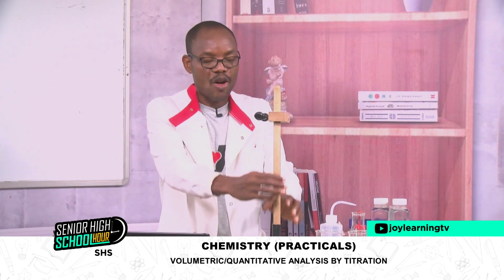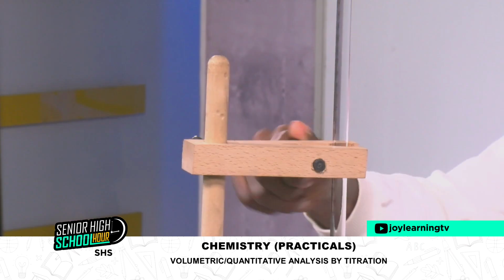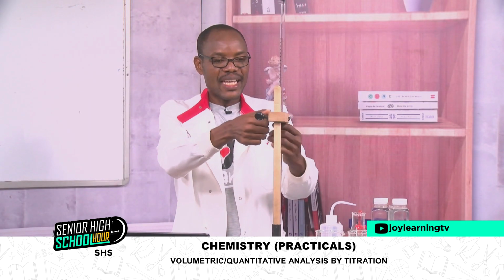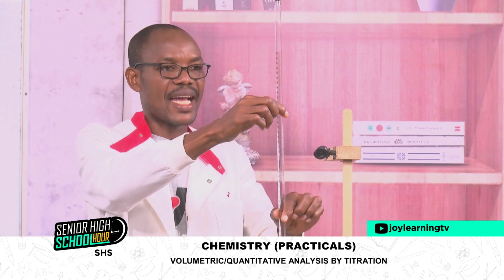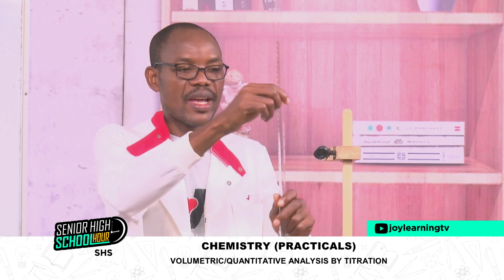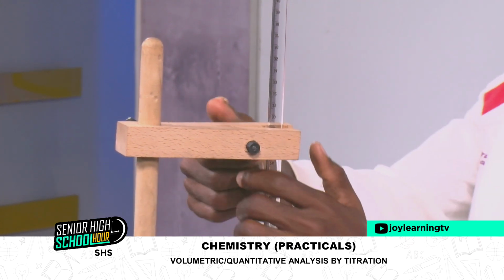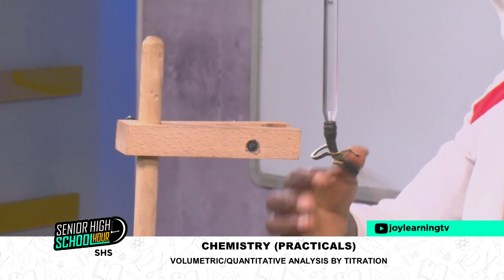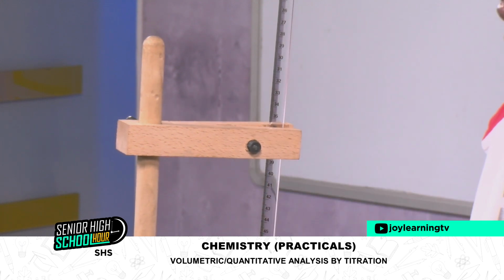Because it is the burette stand or the retort stand, I can mount my burette on it like this. When the burette is upside down like that, you enter a lab and it is upside down like this, it means that the burette is not in use. So always after the end of work, you turn it upside down like that and clamp it firmly. But anytime you come and it is upright like this, then it means that that burette is in use. Probably somebody is about to use it.